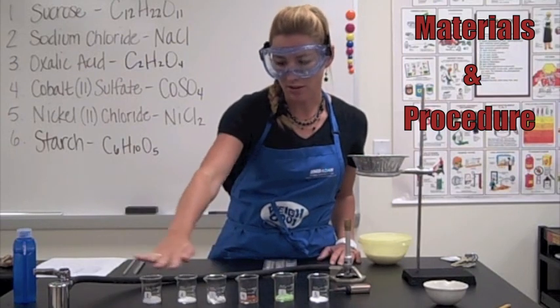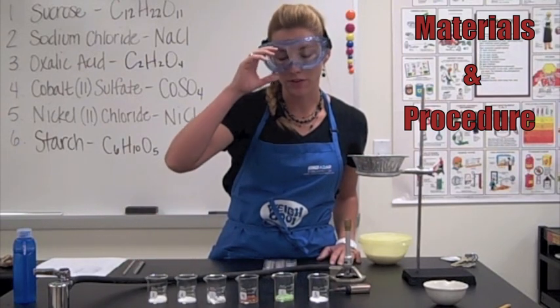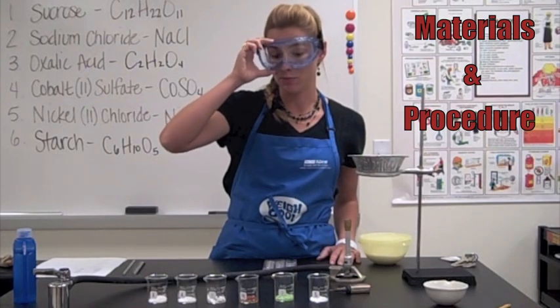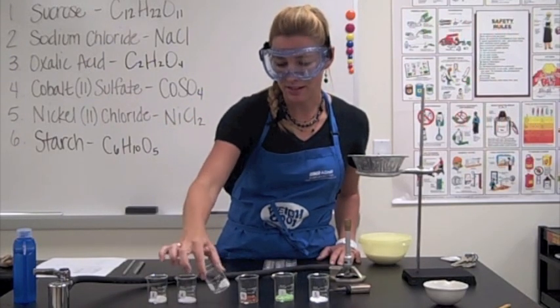These first three white solids look almost identical. Sugar and salt, of course, if you've ever made the mistake at home, you know they look really similar. And the only difference for oxalic acid is that it's kind of sticky.